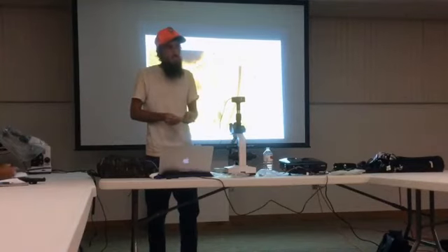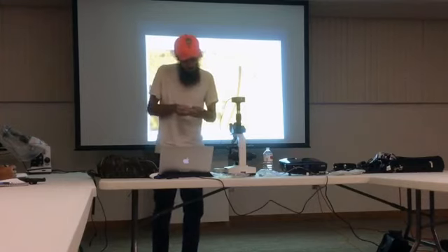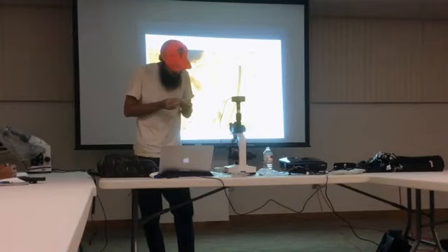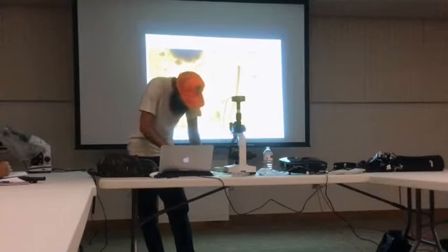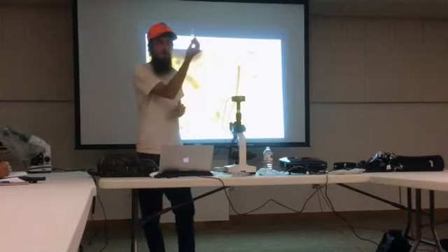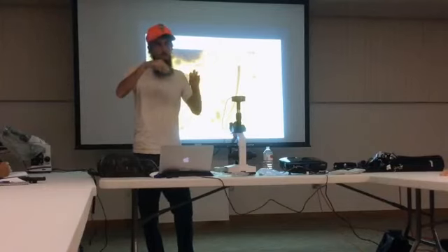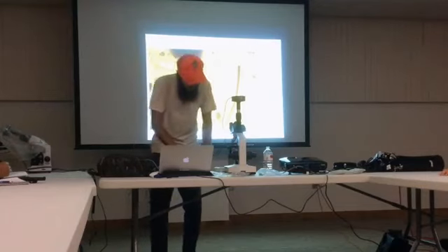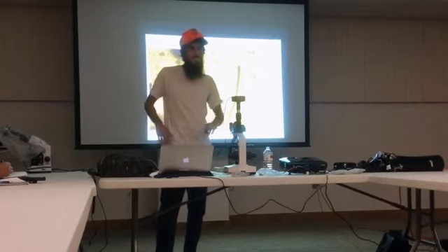I recommend you try to get glass slides too, if you can, even though they're fragile and sometimes they get stuck in your fingers. Plastic is not as easy to work with. Do you use slides with a little depression in them? No, I don't. I do have one, like this one right here has the dimple in it. But I'm trying to get it flat and not have too much depth, because the organisms are kind of going to die. I'm going to smush them.